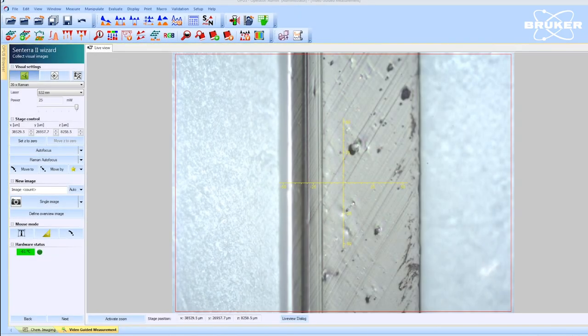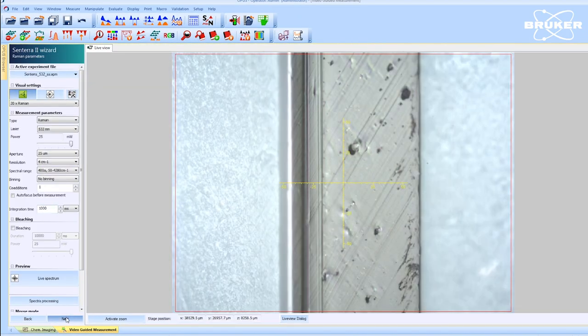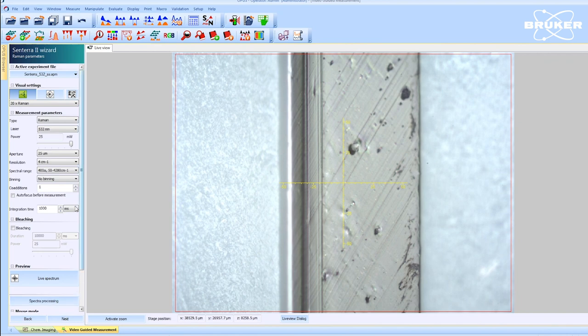The step-by-step software guide then starts with a visual inspection and the creation of an overview image for reference and region of interest selection.